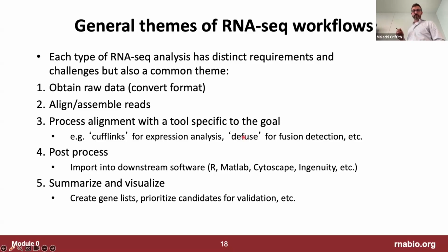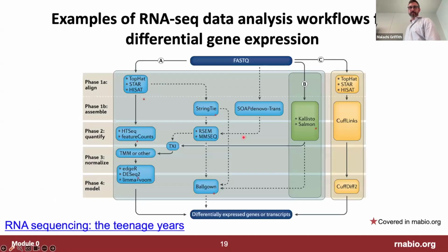And then there's some kind of post-processing where you feed those output files into often R or Python to visualize the data, maybe format it or organize it or integrate it with other data in some way. And then generally some kind of summarization and visualization where we start to do statistics and comparisons and create figures for papers and so on.